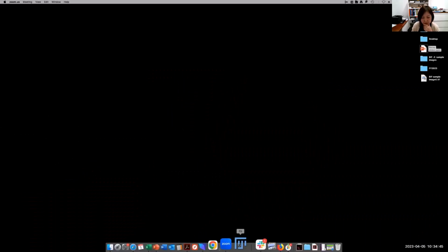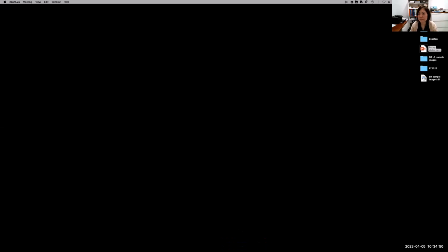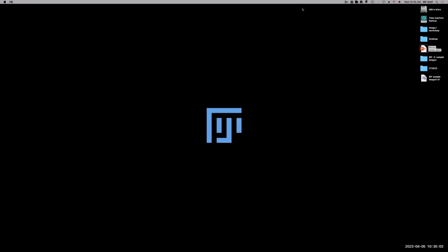The screen share desktop. So I want you to open the Fiji ImageJ software. Am I sharing desktop? Yes, you can see, thank you. Fiji loading.